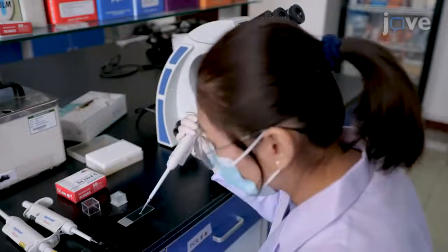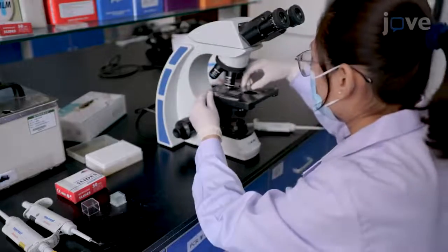Every minute, monitor the release of sporocysts by microscopy.